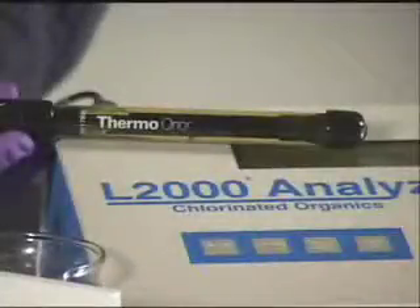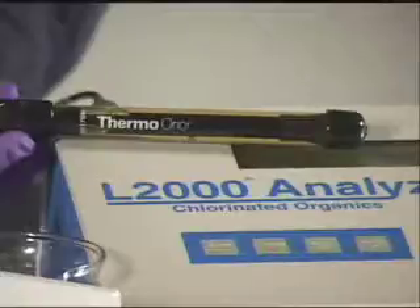The electrode used with the L2000DX is a chloride ion-specific electrode manufactured by Thermo Electron Corporation. The electrode is a highly sensitive, expensive feature of the L2000DX instrument, and its care and handling is very important to its everyday function and life expectancy.